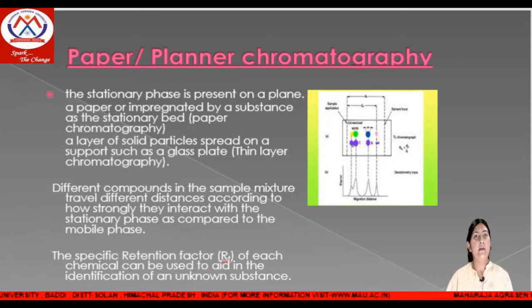There are different compounds in the sample mixture which travel different distances according to their affinity, how strongly they interact with the stationary phase as compared to the mobile phase. The specific retention factor, Rf value, can also be used as an aid to identification of an unknown compound.